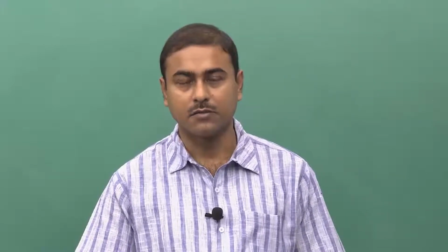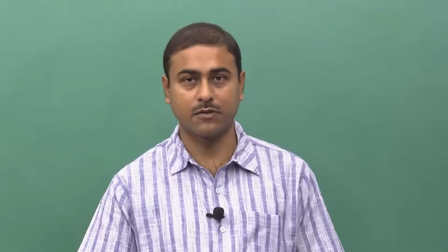Welcome to lecture number 10 of this course, Basics of Fluorescence Spectroscopy. In the last lecture we discussed the instrumentation of a fluorimeter, and I showed a very basic diagram of the instrumentation of the fluorimeter. Let us see it once again.